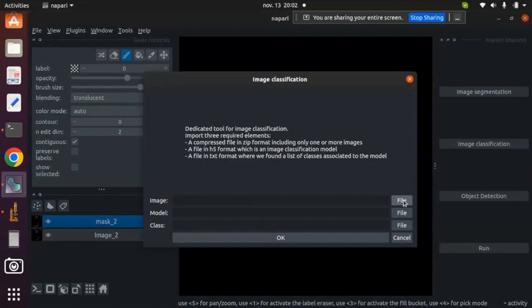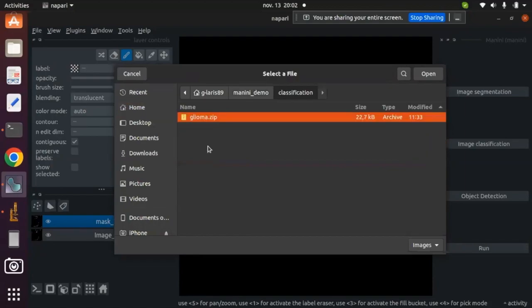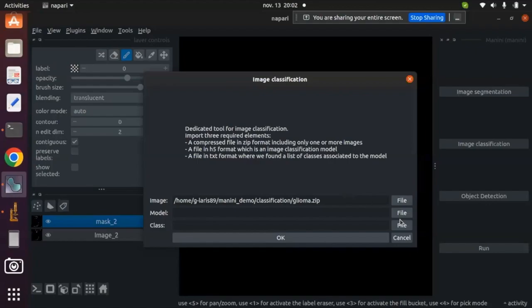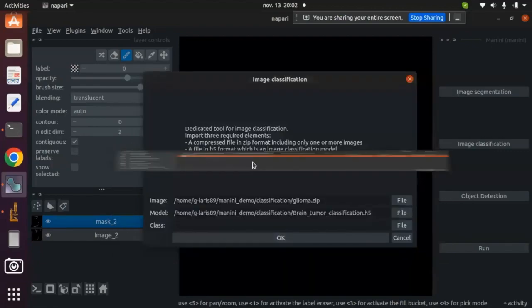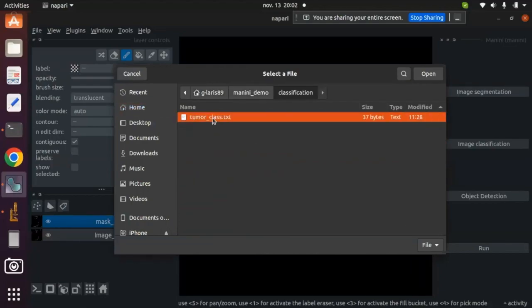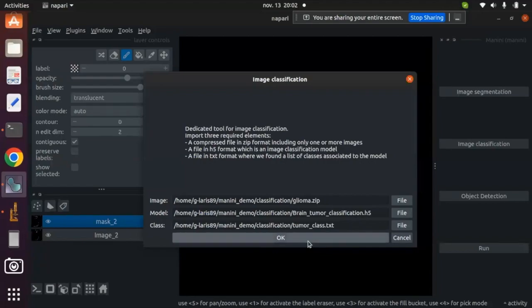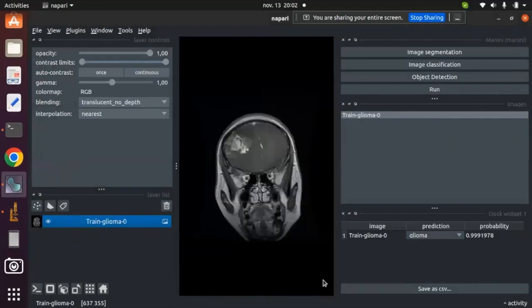Let's start the classification tool. For classification, I click here and import the image. I also import the model. The class file is mandatory for the model — here is the classification file with two or more classes. I click OK and run the inference.